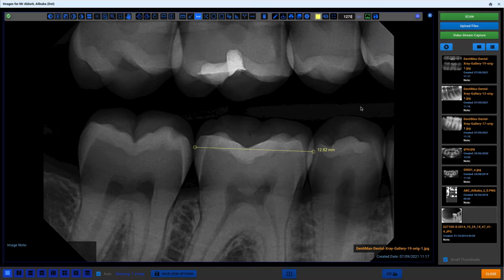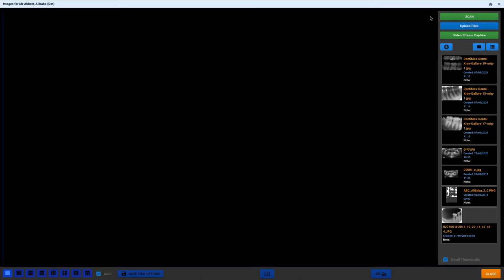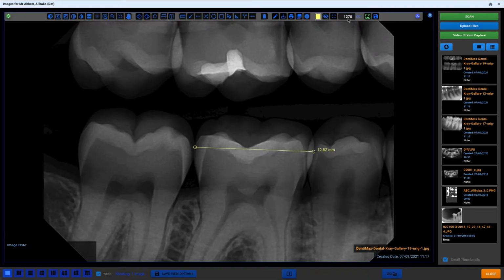Please note that the resolution value is updated automatically with the image. There is no need to click any buttons to save it once you have changed it. You can easily check it by closing and reopening the image. As you see, the resolution and the measurement were saved.